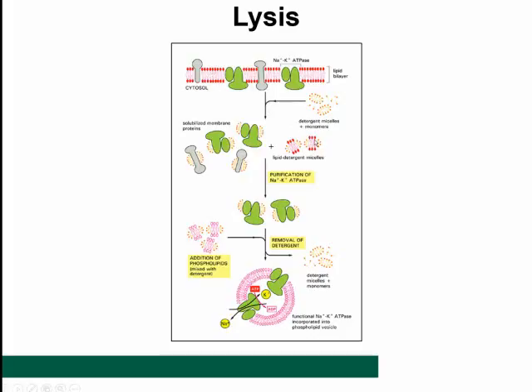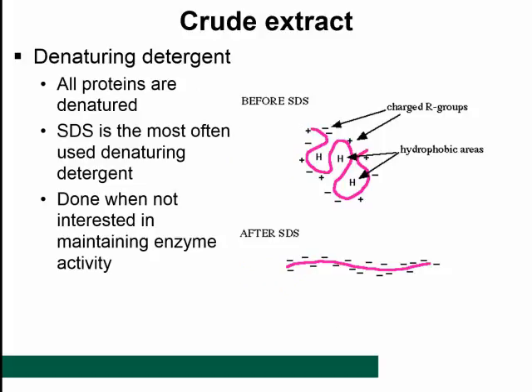Now, you can purify the proteins, and you can dialyze away the detergent right here, but if you were to combine the proteins that you just isolated from the membrane with phospholipids right here in a polar environment, and you dialyze away the detergent, you will get formation of the lipid bilayer and then the transmembrane proteins right here. Okay, so this is how detergents work by lysing the cell membrane.